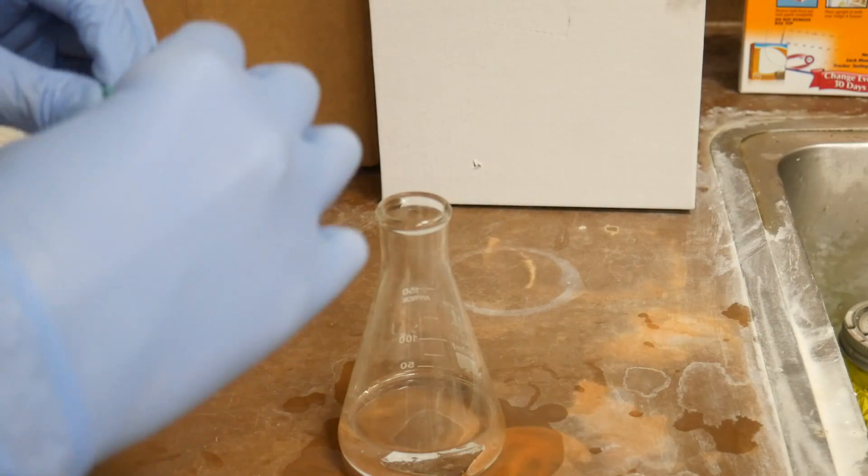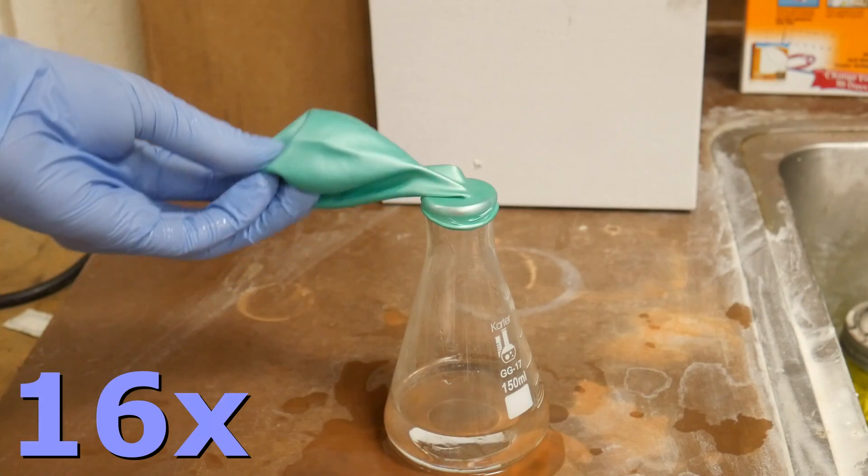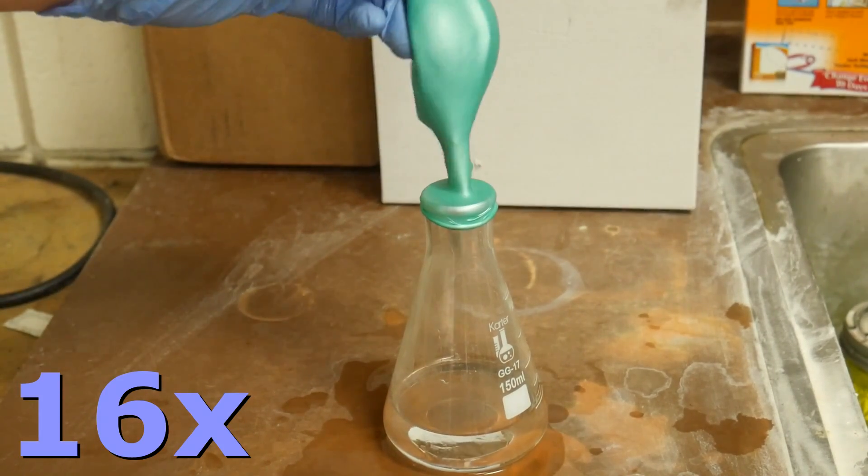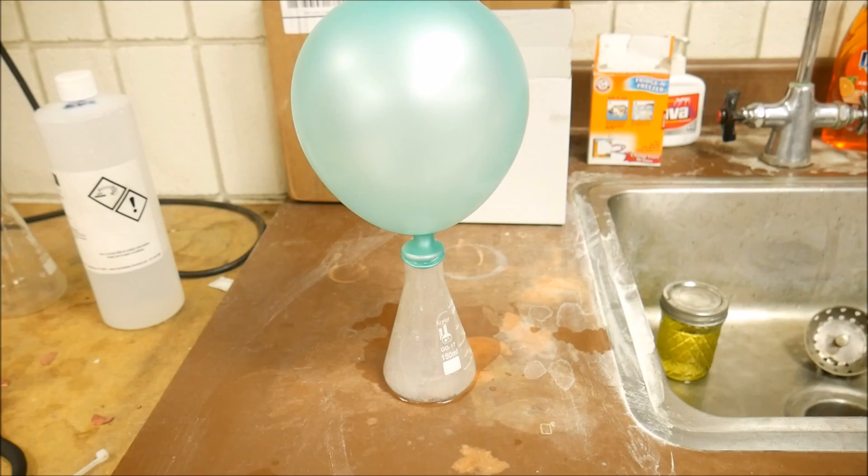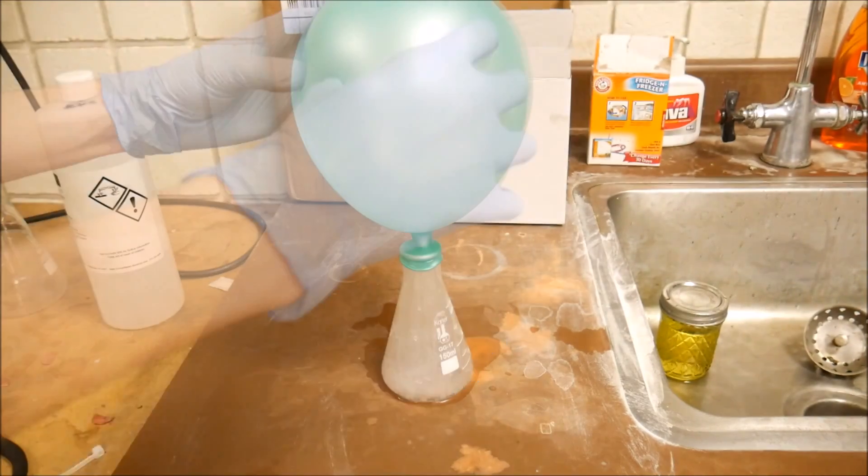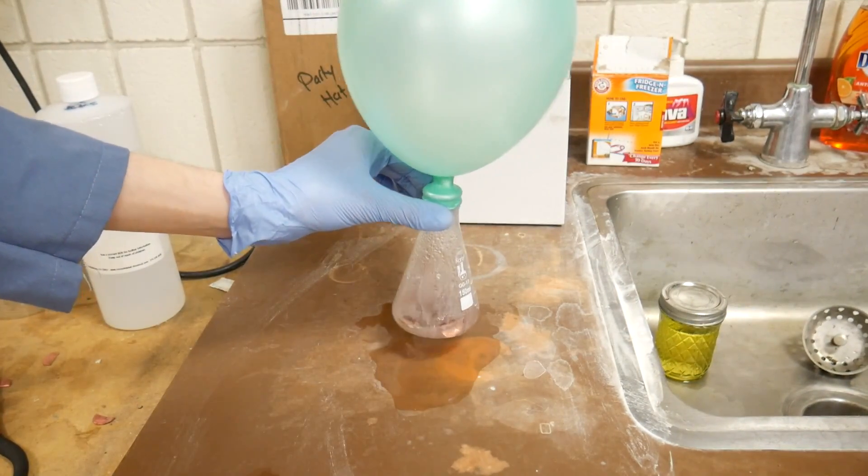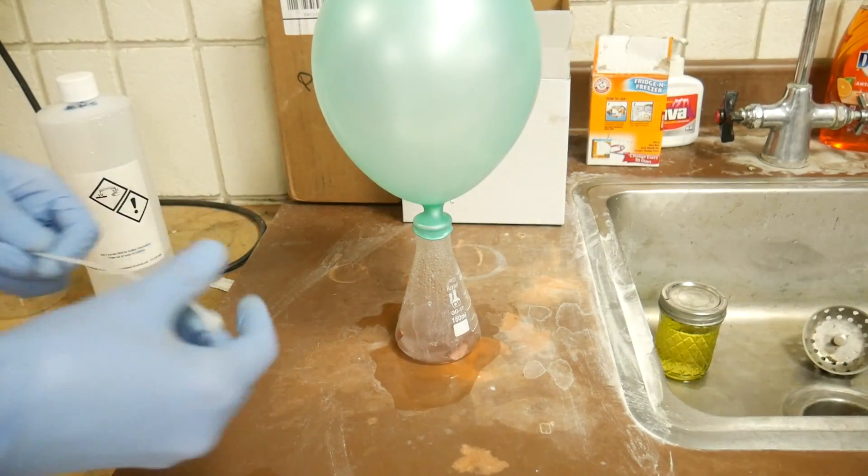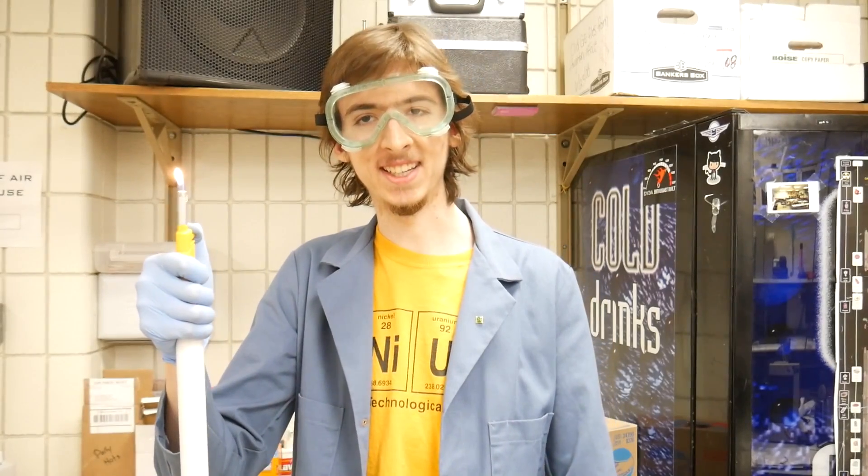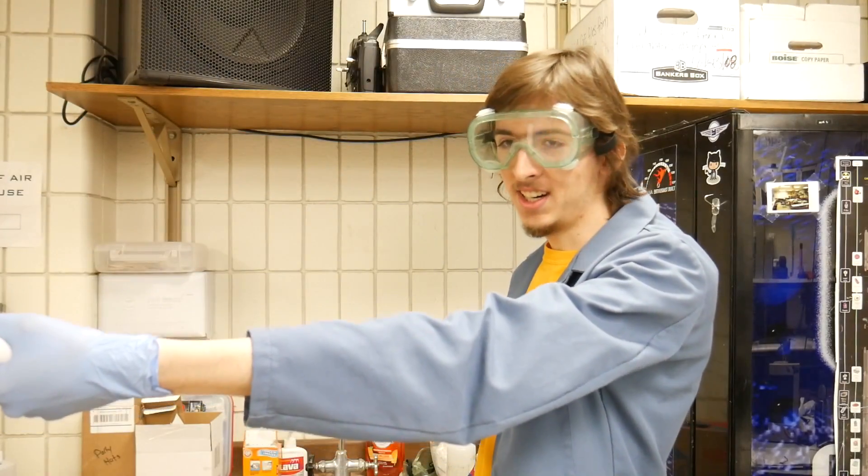All right here we go. Take two. All right that looks like all the hydrogen I'm gonna get. Now I don't know for the life of me how to tie a balloon but I can pull a zip tie with the best of them. While we were waiting for that to finish I came up with a new invention. It's a lighter on a stick. That way I don't need to stand too close to the balloon when I ignite it.